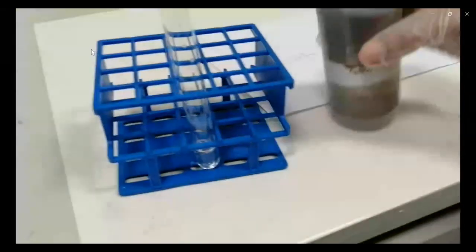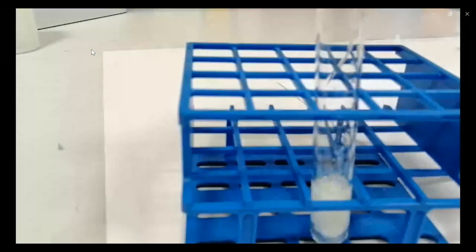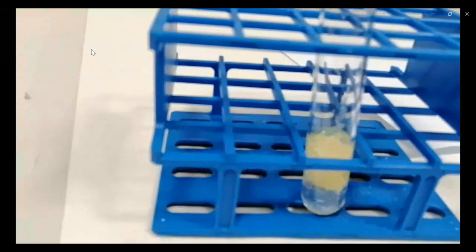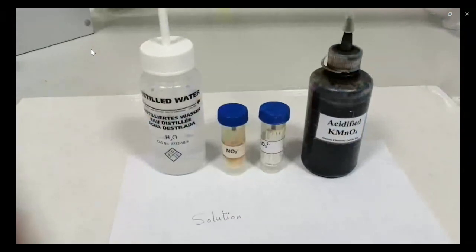You will see a white precipitate, which changes to yellow, to gray, to brown, and you end up with a black precipitate, which is silver sulfide, Ag2S.